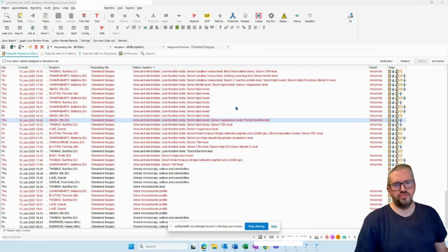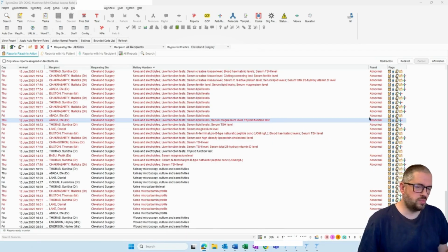Hi there. This video is a brief introduction to how our systems will change the way you manage and file your results. So if I come now to review some results, the first thing I'm going to do is check for this blue arrow icon on the right hand side. If I can see that, it means that the auto review rules in System 1 have been applied. If there are some where that's not been done, before I do anything else, I'll click this Apply Auto Review Rules button. That would bring up a list of names of results that haven't been checked yet.